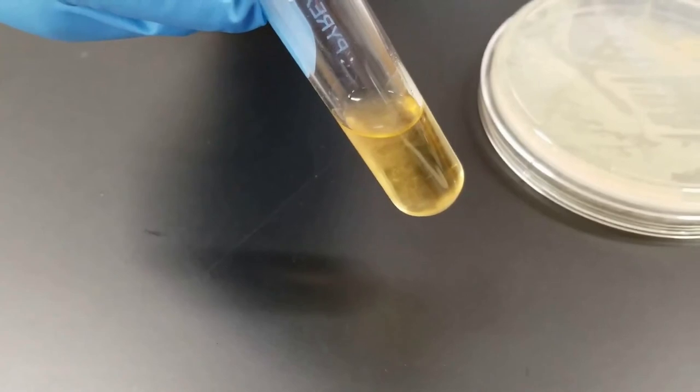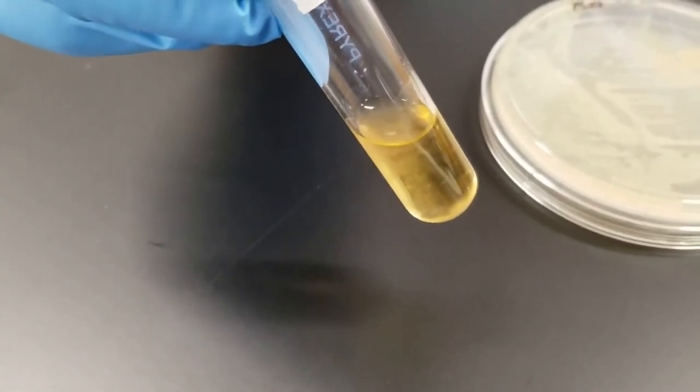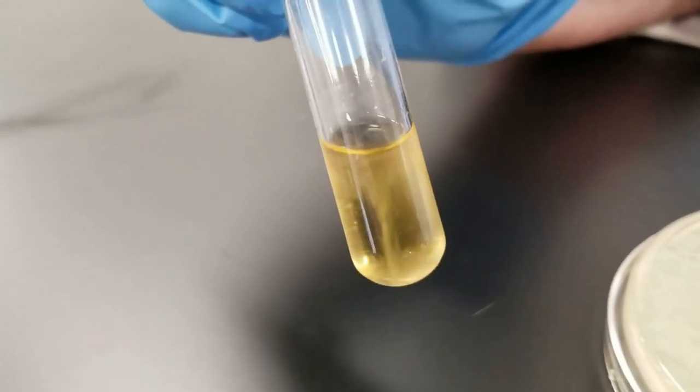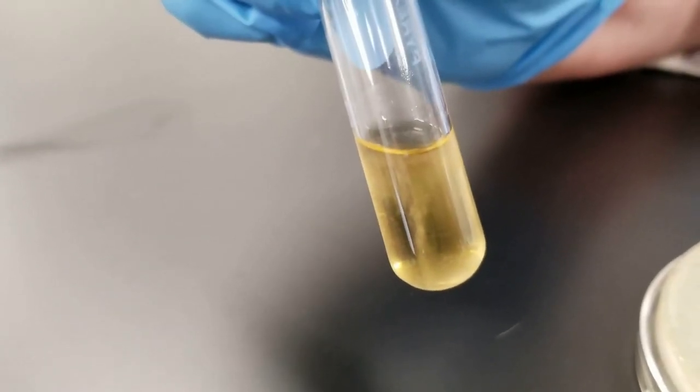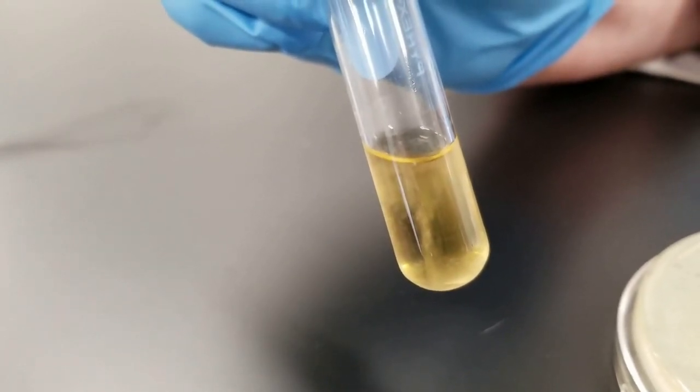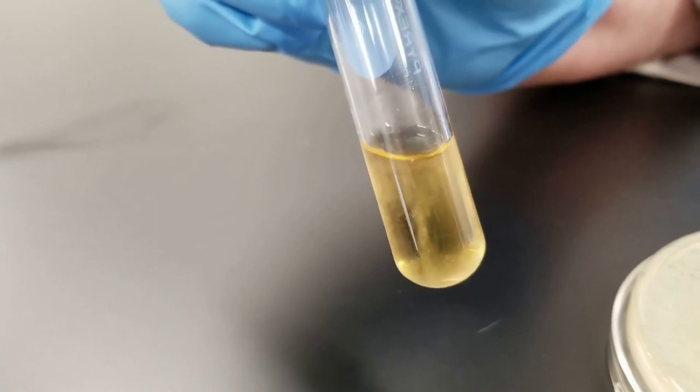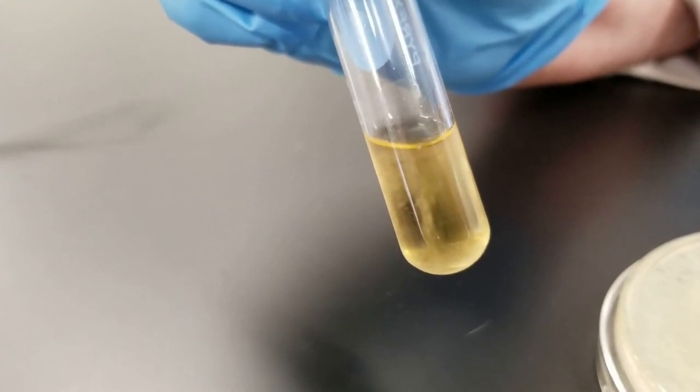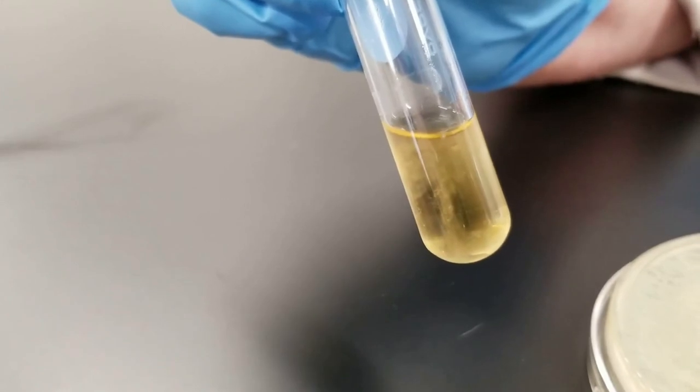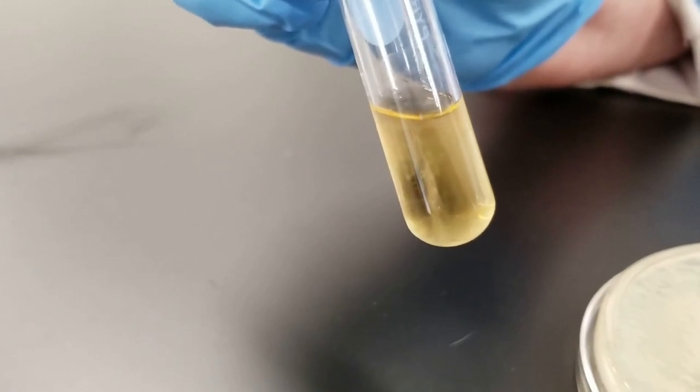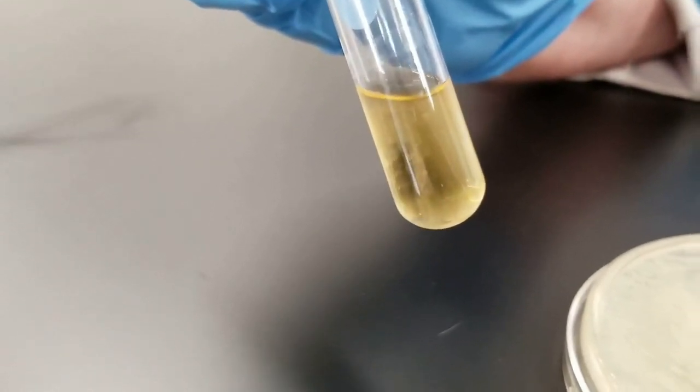That means it needs oxygen. It prefers to grow, given a choice, it prefers to have the atmospheric level concentration of oxygen. If the growth had been solely at the bottom of the tube, that would have told us that it does not like oxygen. It prefers to grow anaerobically. Some organisms' oxygen will actually kill it. If there was steady growth throughout the entire tube, that would tell us that it's an organism that, hey, I can grow either way. I don't really care. But the way the growth pattern is on this, it tells us that Serratia prefers to have the oxygen. Therefore, it's growing at the higher upper portion of the tube.